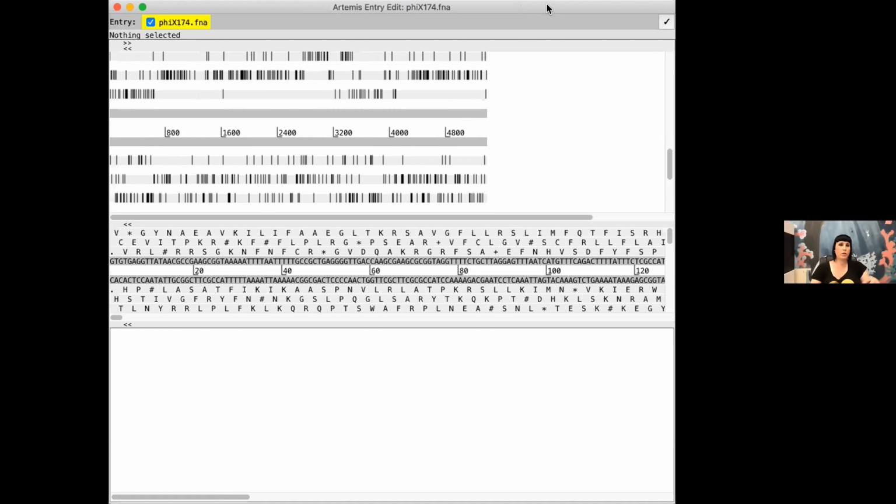And if you're me, you can really see where the genes occur just by looking at where the stop codons are, because I've been looking at genomes for so long now that I just automatically see where things are. But one thing to help you, you go up here and you do the graph, the GC frame plot, and that shows you here. I'm going to change the window size from 120 up to like 200 just to show it more visibly. What this tells you is that, especially here, there's a gene because there's just this really long region, and it's very improbable that there's not a gene there.